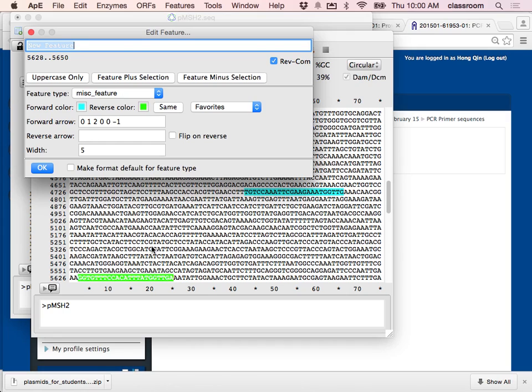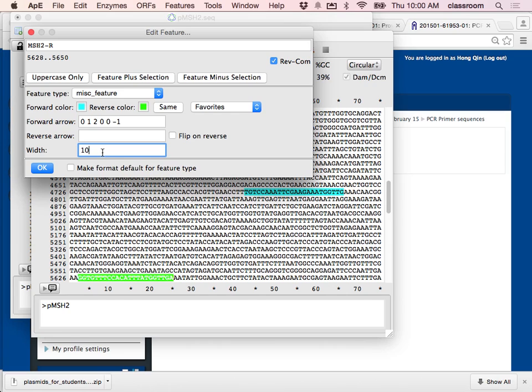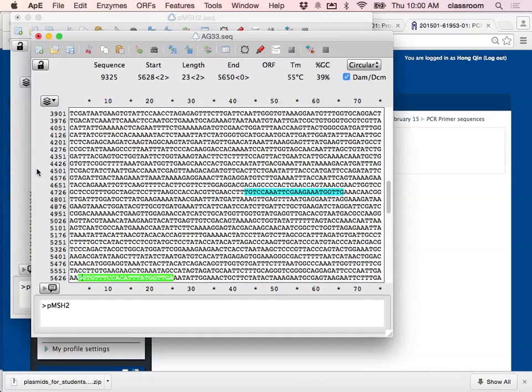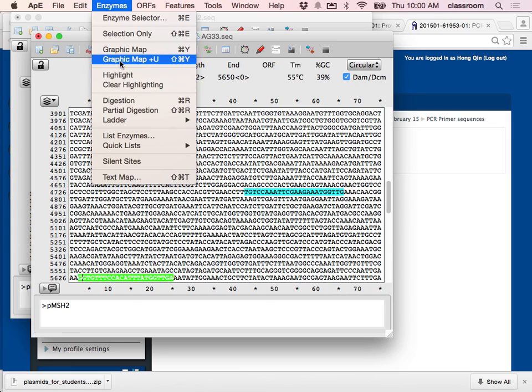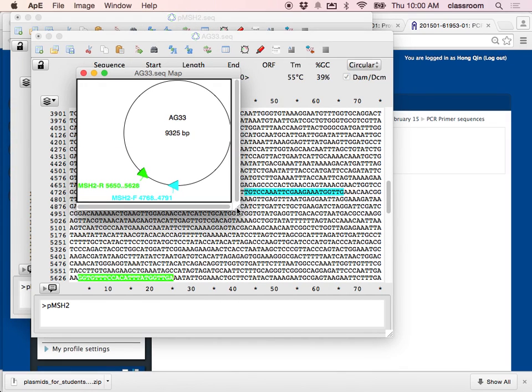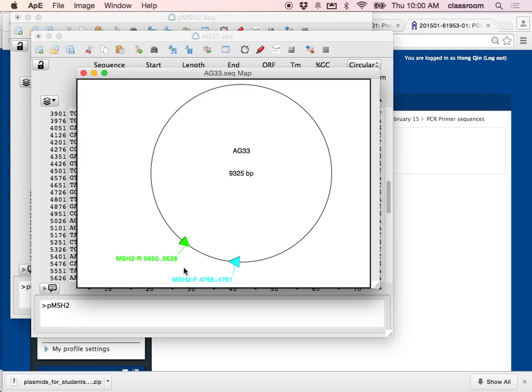The forward primer is in blue and the reverse primer is in green. I label this MSH2R reverse primer and make the arrow obvious. Looking at the graph, I can now calculate how big the PCR product is going to be. One primer position is 5650 to 562x and the other is 4768 to 4791.